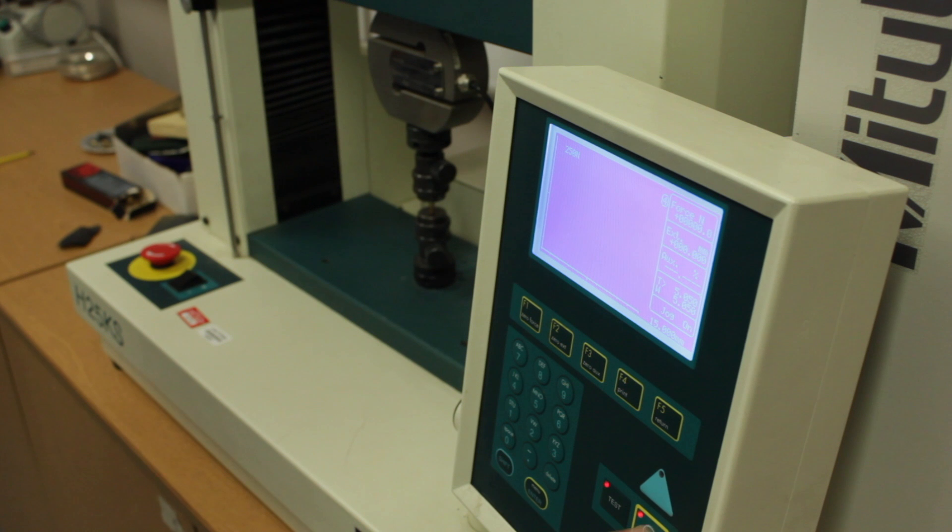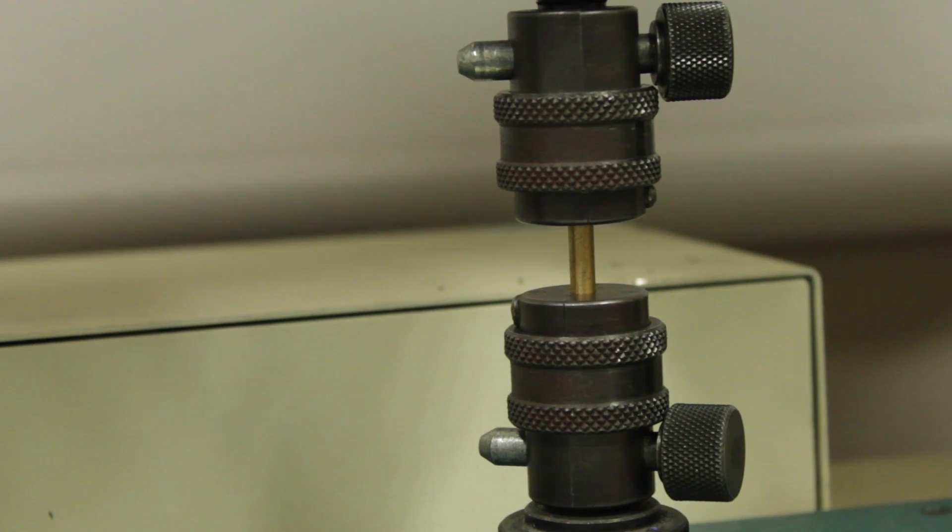We'll then hit the test button and enter continuous jog mode before pressing the up arrow. This will run the test. Ensure that you're wearing safety goggles and that you're stood well back from the machine.